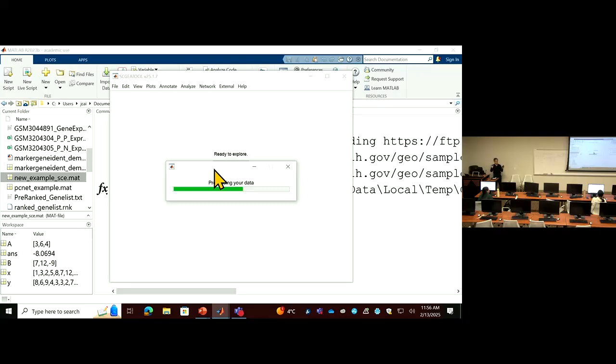There are many other ways you can pool or merge two different samples together, but this is the easy way. You don't have to touch anything, and automatically you get two separated groups of cells from two different sources. Then we are going to annotate the cell type automatically, and then start to compare across these two samples for any given cell type to find the differentially expressed genes.